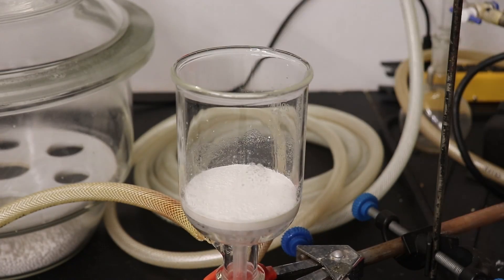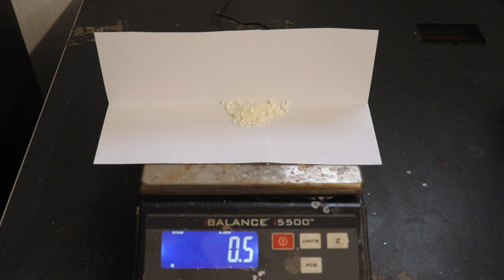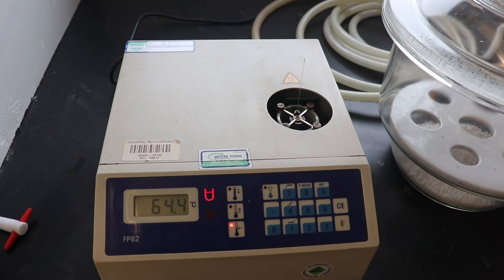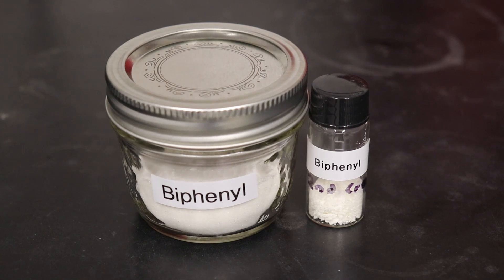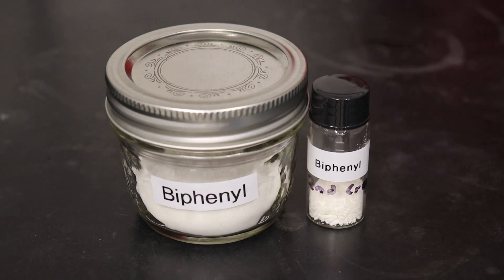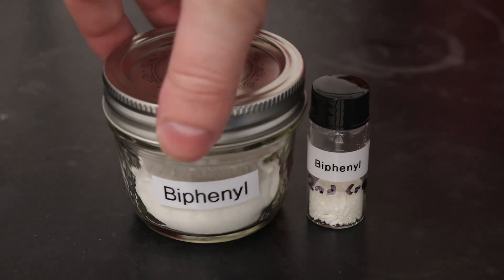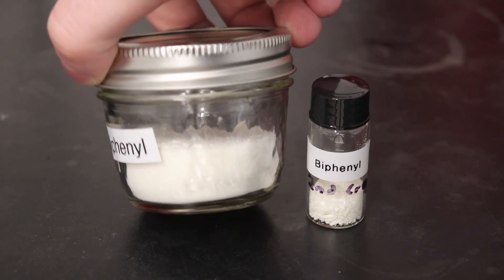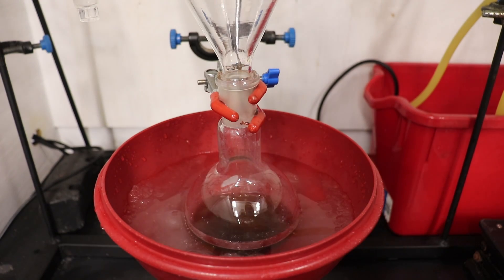But only another 0.5 grams of biphenyl was recovered of an inferior melting point of 64.4 degrees Celsius. It's quite possible that the crude biphenyl had a significant percentage of impurities leading to a low recovery on the recrystallization. So we need to think of some other reasons on why this yield was suffering.